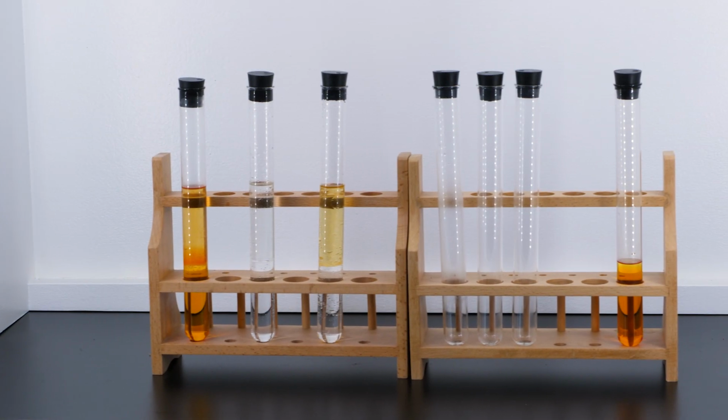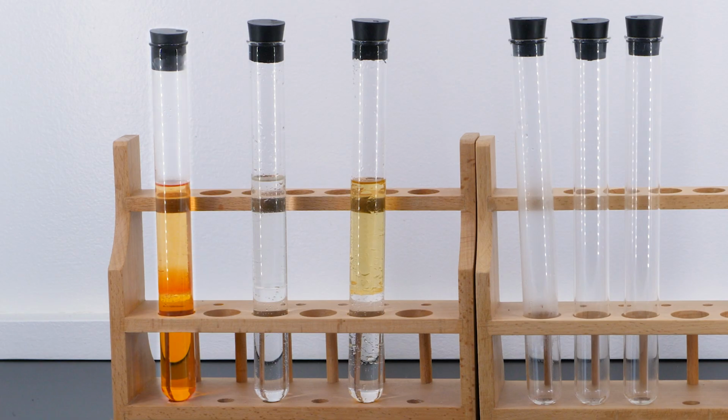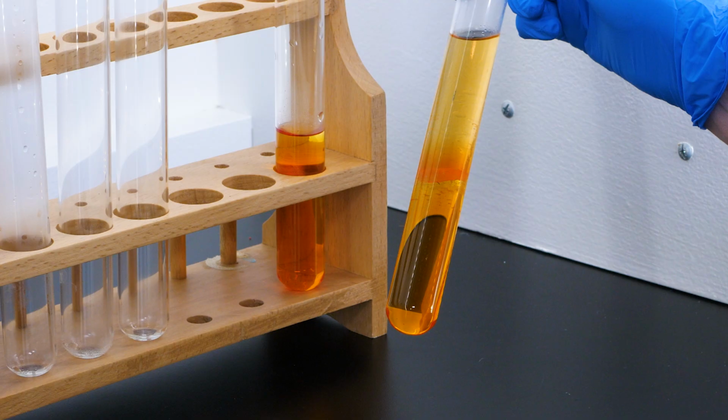Now that the test tubes have remained undisturbed for several hours, let's examine the results of our experiment. The contents of the test tube containing cyclohexane and bromine water separated into 2 layers. The top layer is a mixture of bromine water with cyclohexane. The bottom layer is bromine water, which is denser than the mixture, so it settled to the bottom of the test tube. When we hold the test tube near the test tube of bromine water, we see that the color of the mixture at the top of the test tube is still orange, which indicates that no reaction occurred.